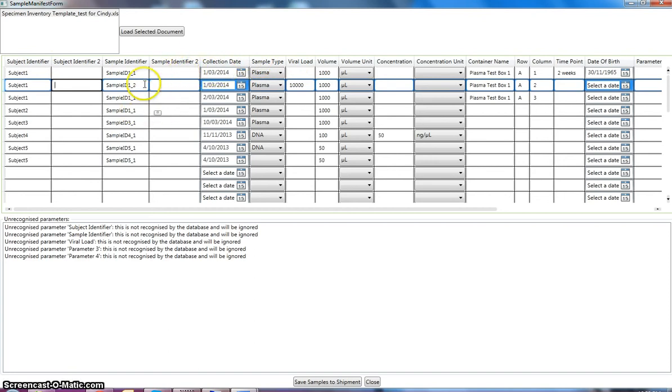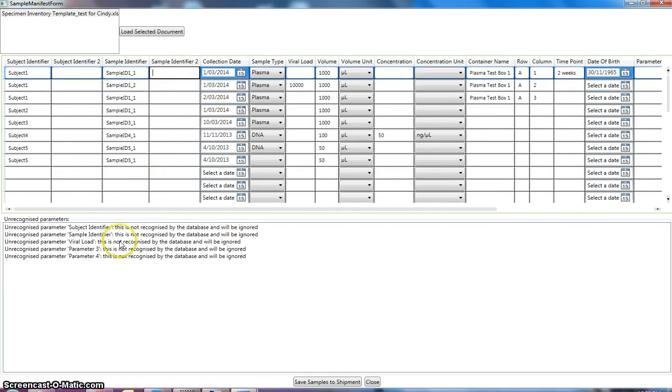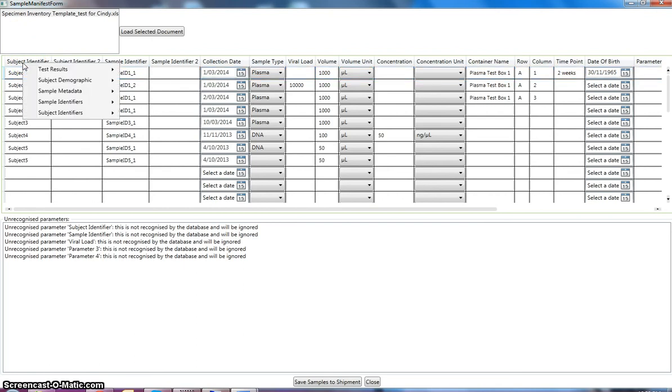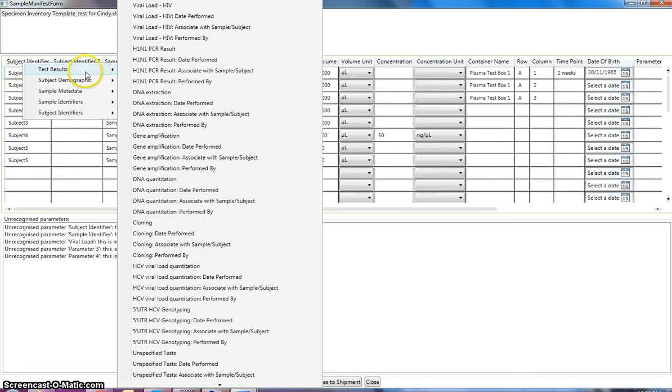It tries to work out where the headers are for our spreadsheet by looking at the sample type column. So it finds the sample type column and starts importing from there. So as we can see if we click into the grid, you can see that there's some unrecognized parameters. We've got a defined set of parameters that the database recognizes as sample metadata. So these ones aren't recognized by the system. But we can use this software to help us define what this metadata is supposed to be.